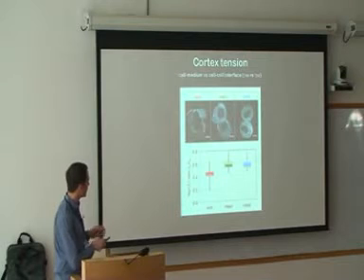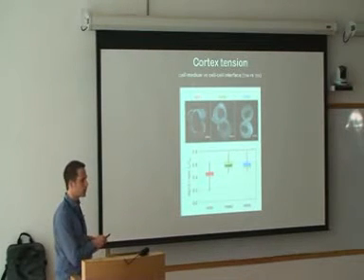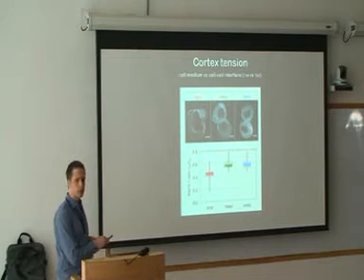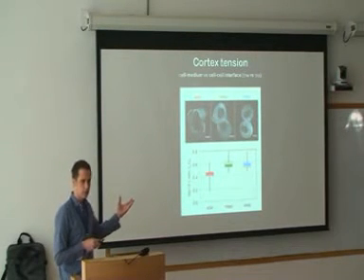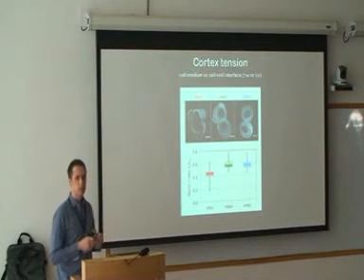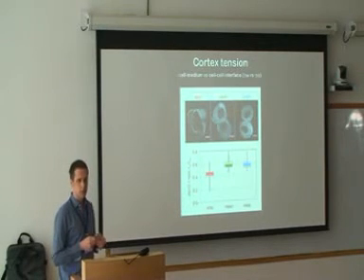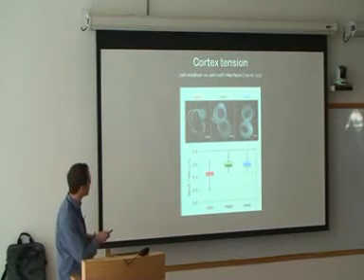One way, and this is a quick and dirty way, and I'll show you a better way then, is just looking at the localization of actin and myosin at these different interfaces. Since we know what the cortical tension at the cell-medium interface is, then by looking at the differential distribution of actomyosin, we can look at the ratio of cortical tensions, assuming that actomyosin would scale with this cortical tension, which is all a bit shaky. Basically, this is sort of a quick and dirty way.